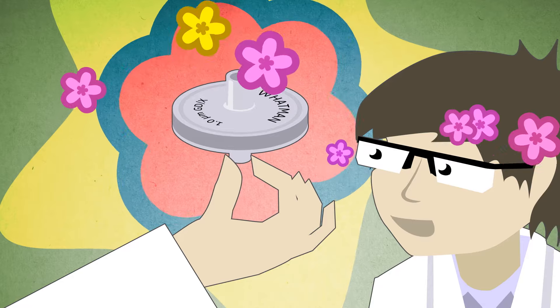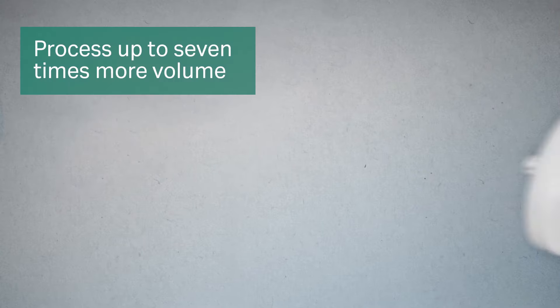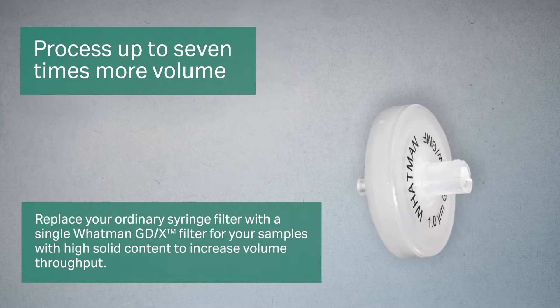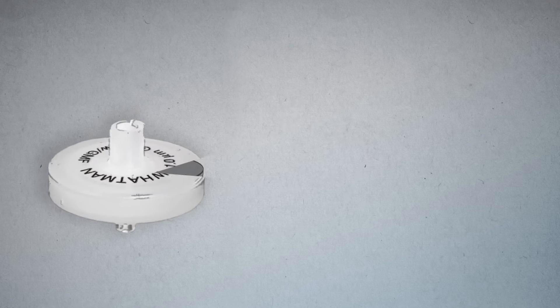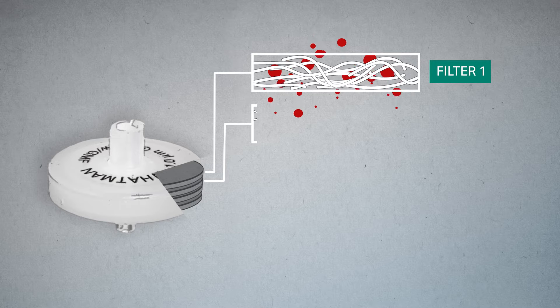Try this instead. By replacing your ordinary syringe filter with a single Whatman GDX filter from Cytiva for your samples with high solid content, you can process up to seven times more volume. The pre-filter stack is designed to retain the bigger particles at the top and the smaller ones at the bottom.